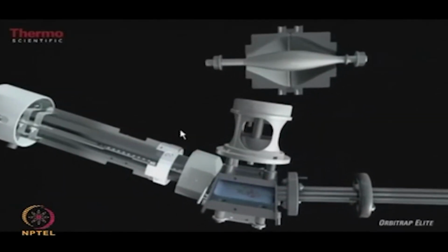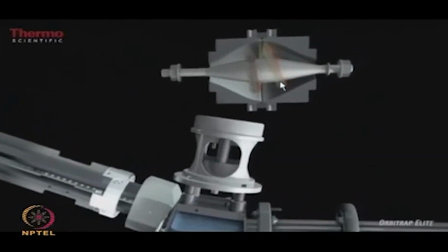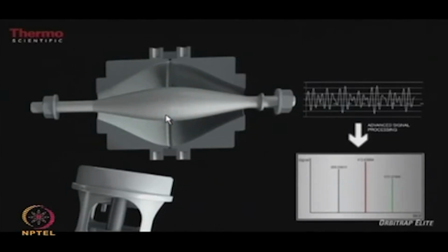This C trap cools the ions and makes them into a packet of ions, so that the packet of ions is injected into the Orbitrap. Because the Orbitrap itself is a static field, you have to inject the ions tangent to the field. Once the ions go into the Orbitrap, they move in orbit, and the frequency is recorded, which in turn gives you the mass spectrum.